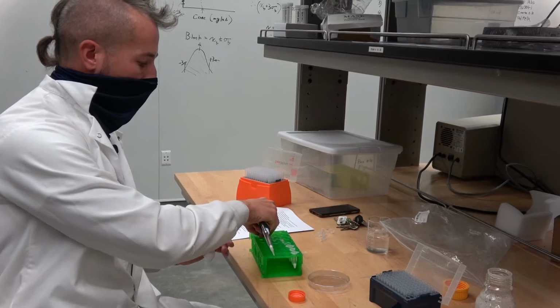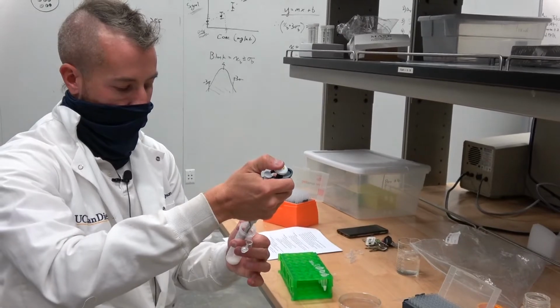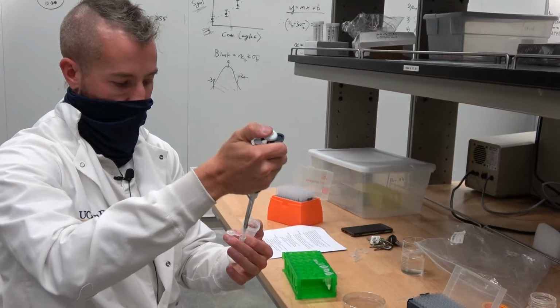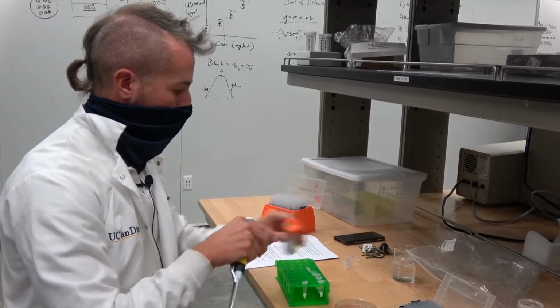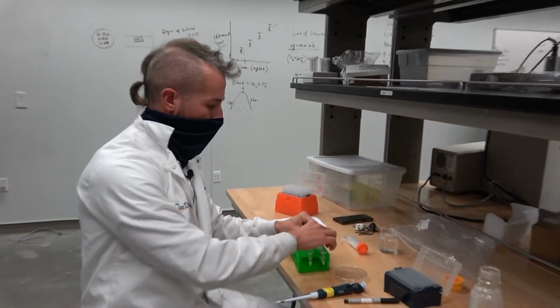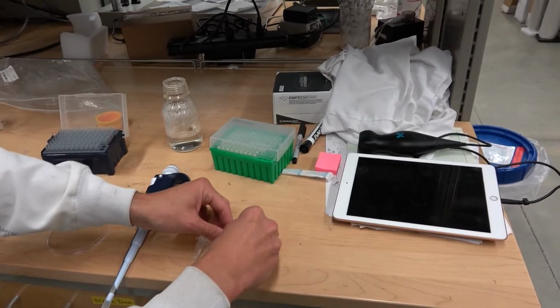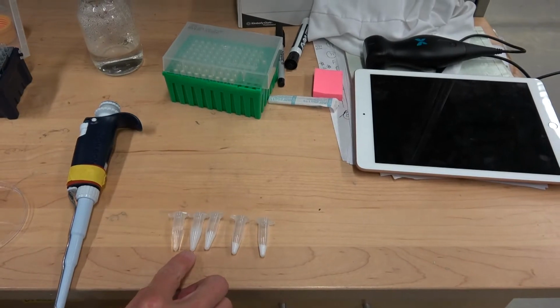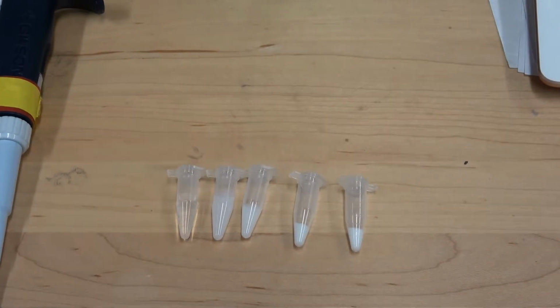I'm going to have one sample that's my undiluted stock. So again, I want 200 microliters. And so there's 100, 200. And then finally, I have a sample that is just water, okay? So hopefully you can appreciate the differences in color from high to low. So this one is clearly more dilute than these higher concentrations, okay?